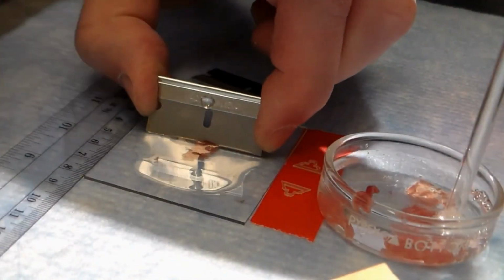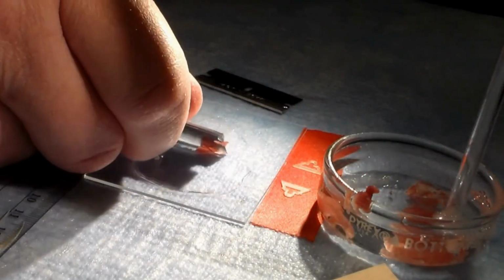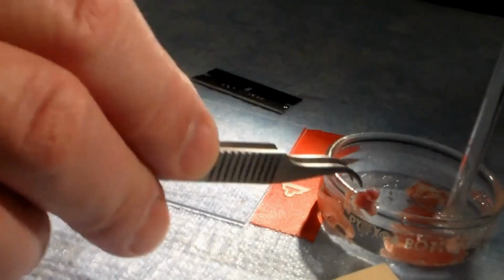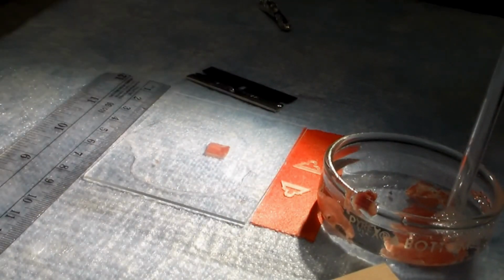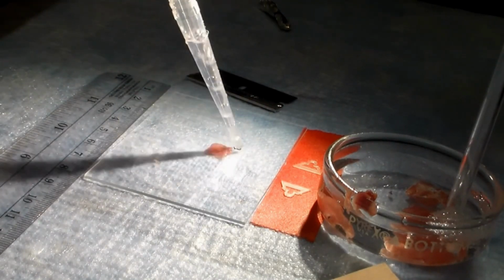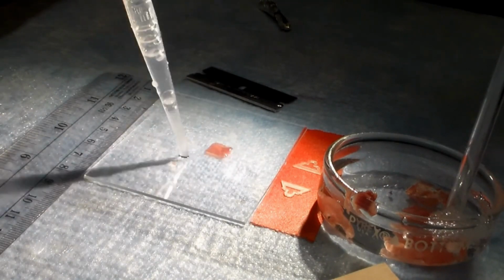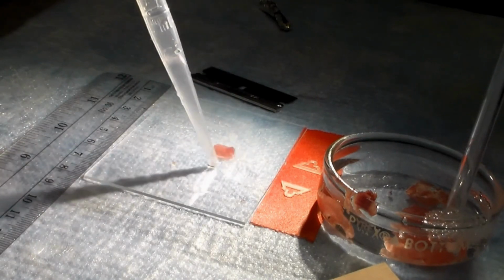And after the slice has been cut into that square or rectangular shape, we'll put some more histoacryl down, in this case on an old razor blade, and take away some of the excess solution so that we have clearer access to the slice itself.